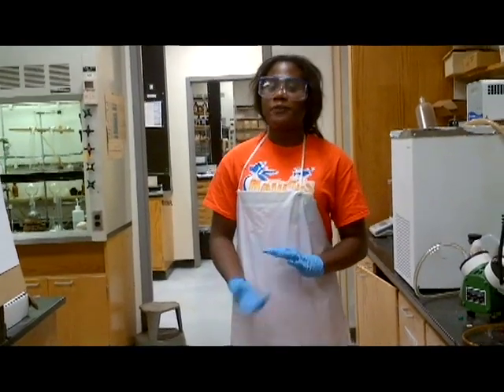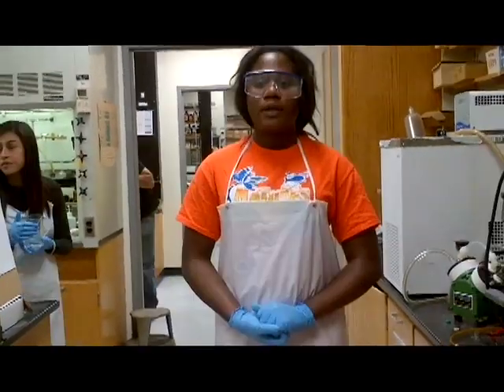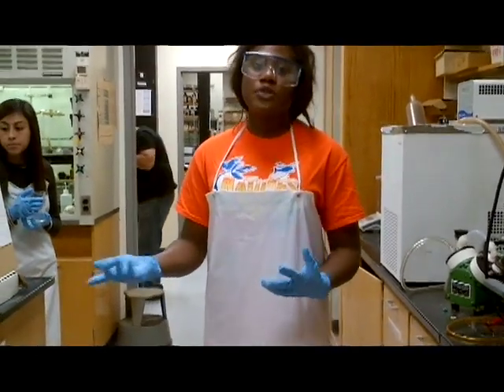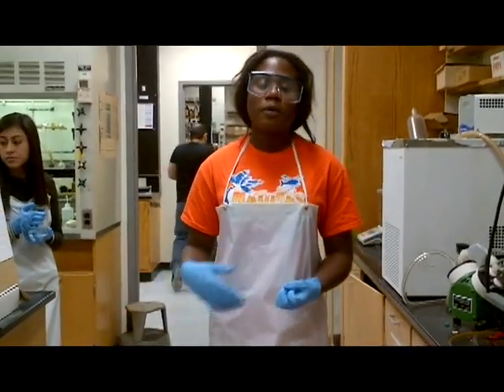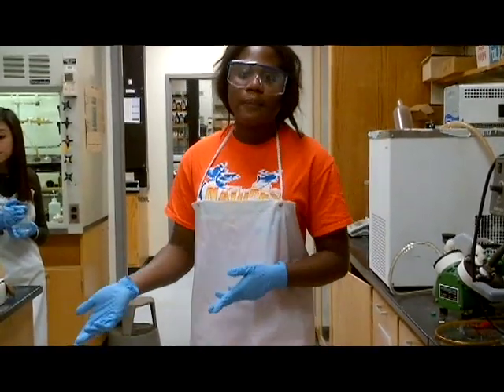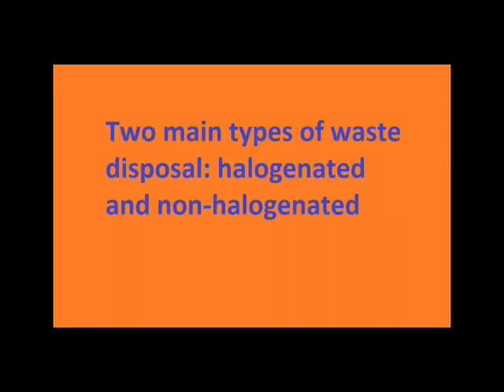This is part 4 of the video, and it has to do with hazards. That is why it's definitely important for you to be very sure on how to dispose of the waste. And your TA will most likely mention that in class, and it will also be in your lab manual.